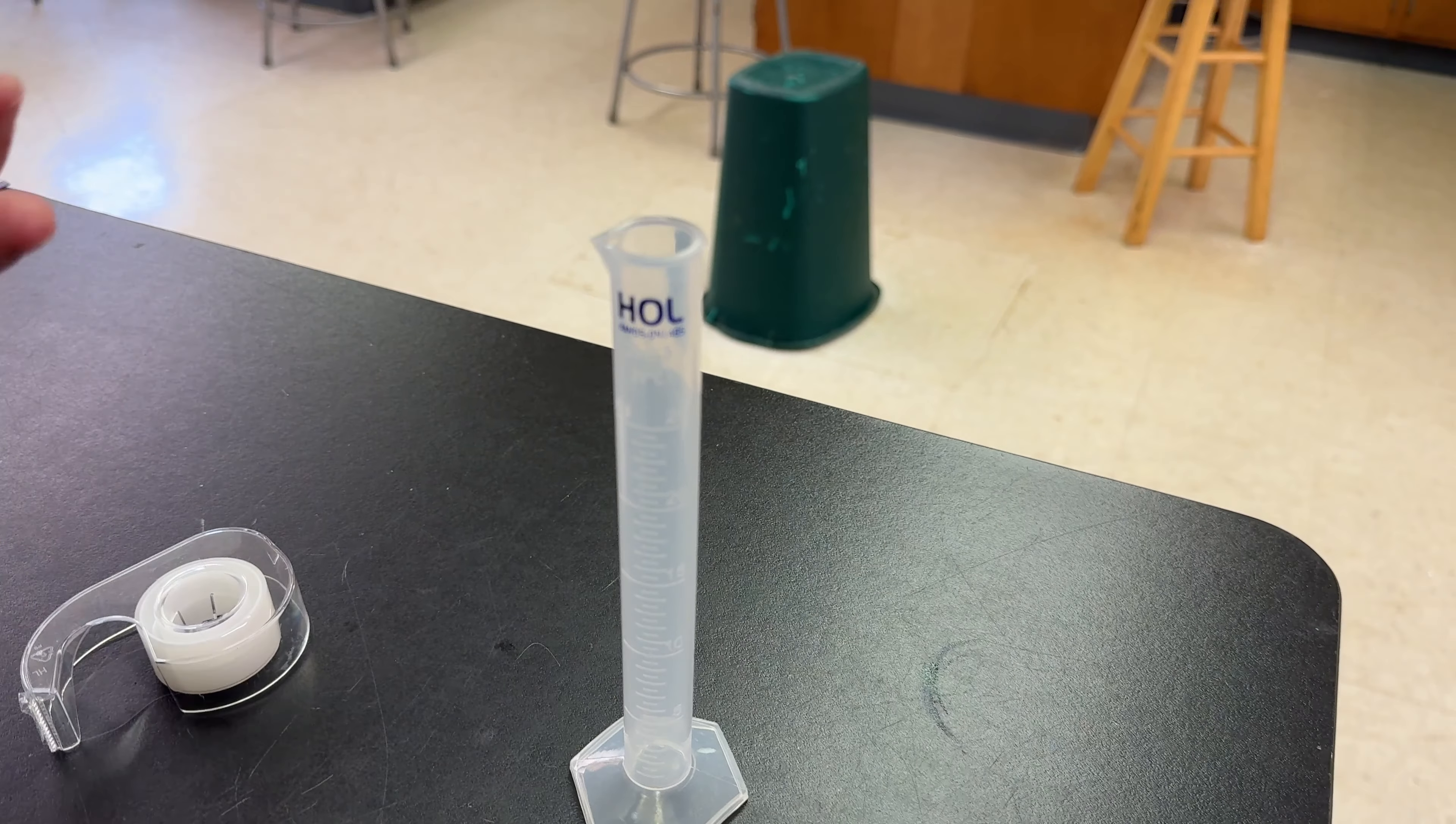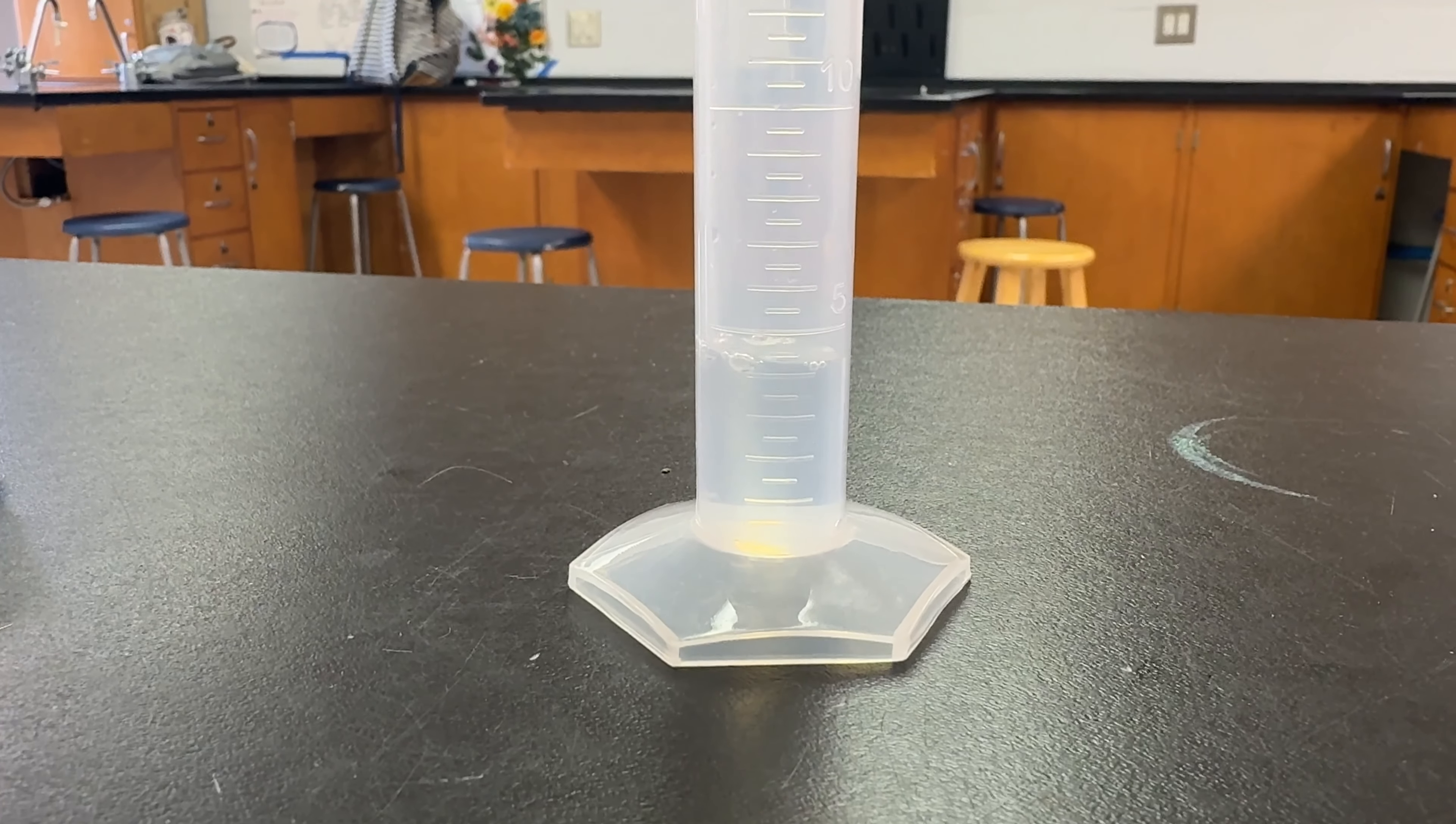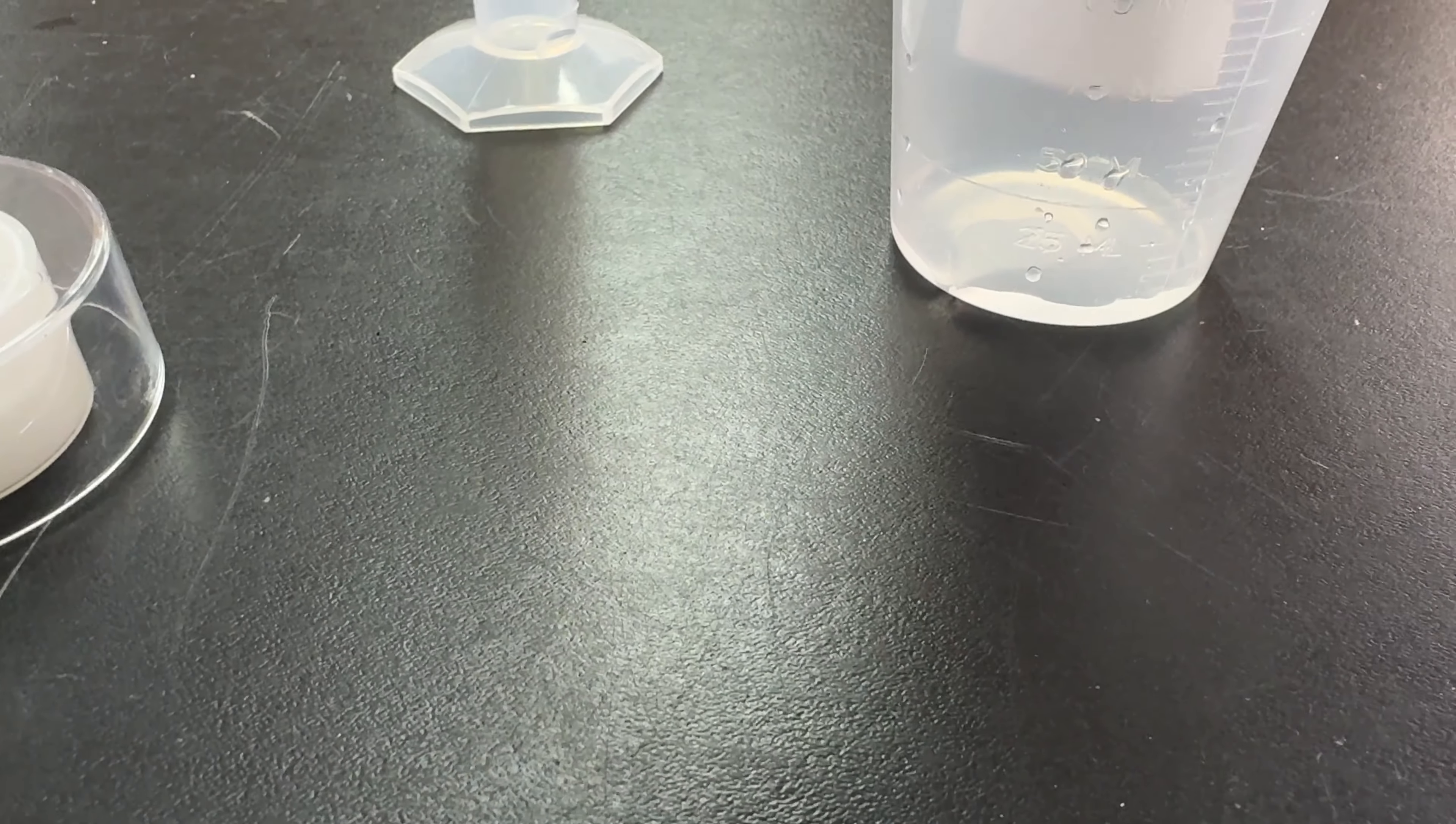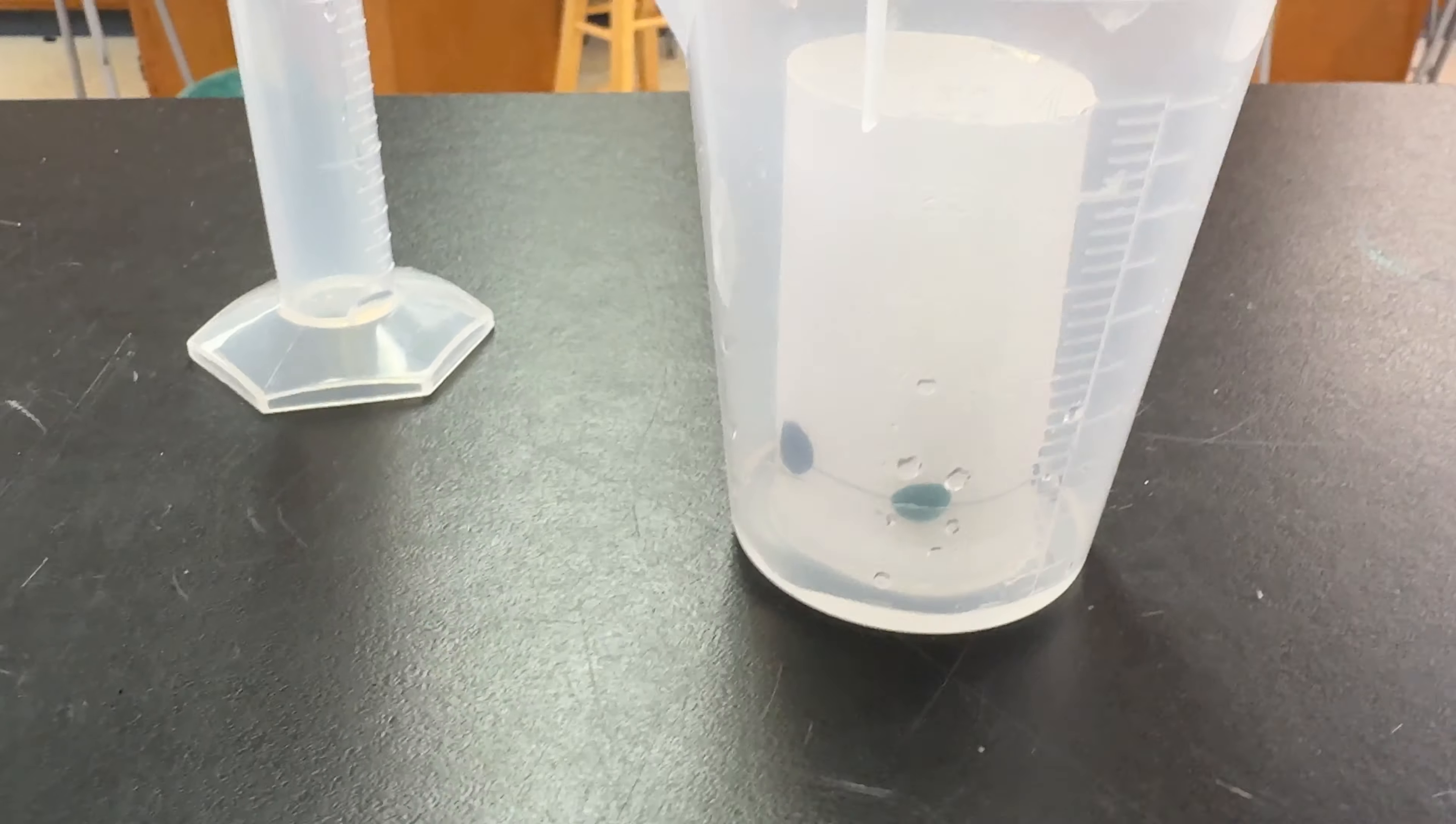Step six: put three to four milliliters of distilled water into a 150 milliliter beaker to obtain a depth of about three millimeters. You're going to put the paper cylinder into the beaker with the spots down.